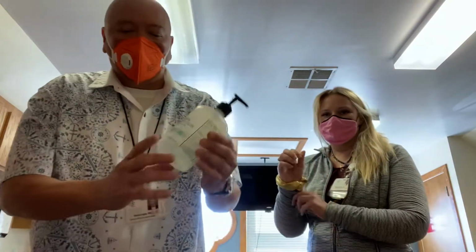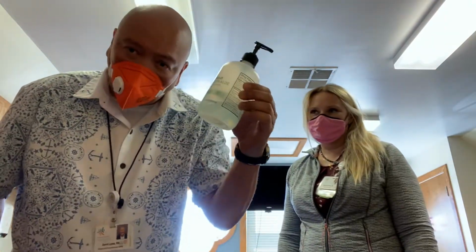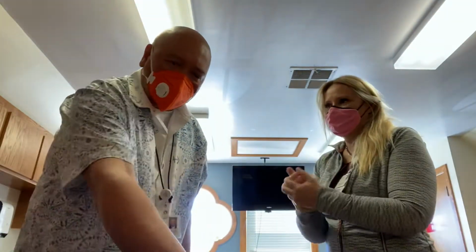I'm Elizabeth Ennis. I'm a physician assistant, and today we're going to go over donning and doffing of proper protective equipment. Okay, so we'll start off. The first thing that we need to do is make sure that you wear the proper gear. The second is to make sure that there is proper hand sanitation with regards to the use of alcohol-based hand sanitizers. Before we start the process, we want to make sure the hand sanitizing happens.